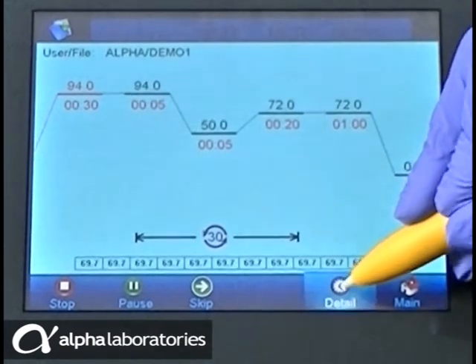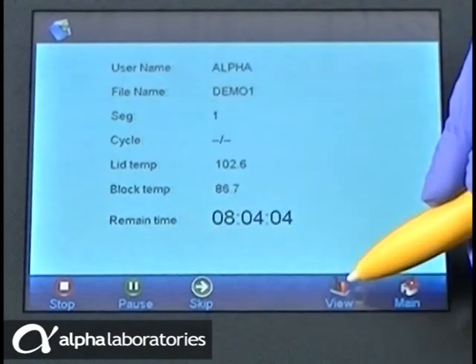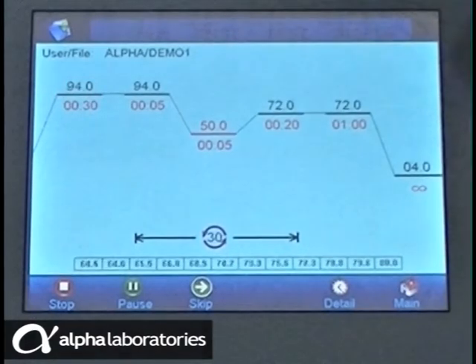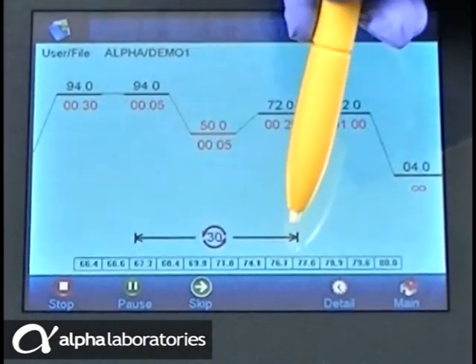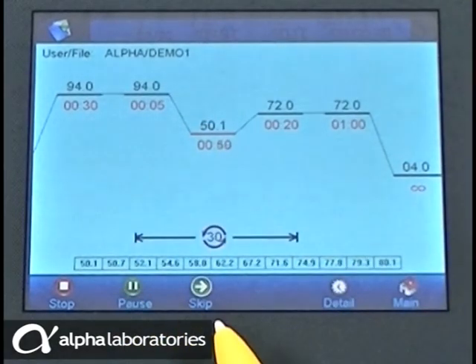At the top of the screen, you can see what the current segment phase is, current cycle and current block and lid temperatures. With a gradient applied, the grid at the bottom of the screen shows the temperature range across the wells during the gradient segment. You can pause or skip steps at any time.